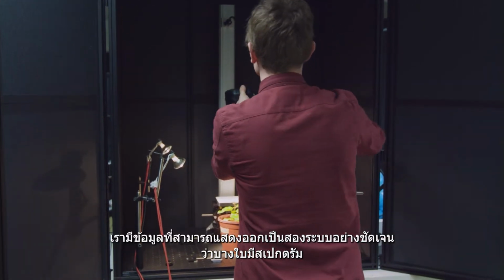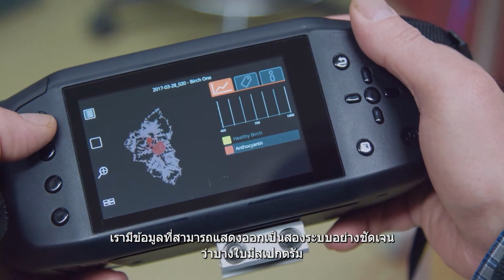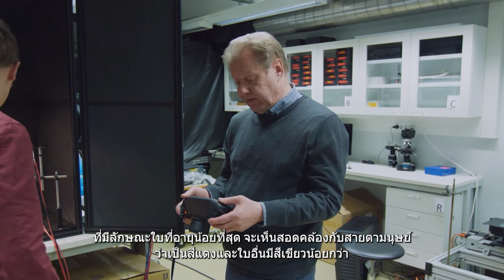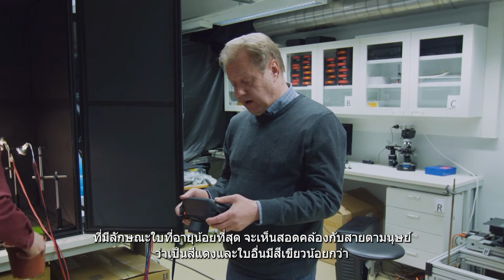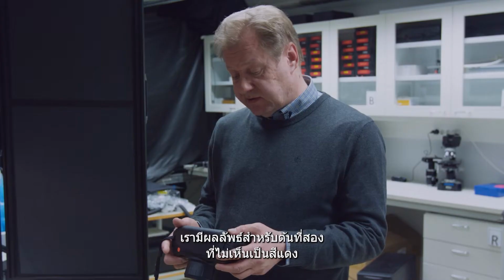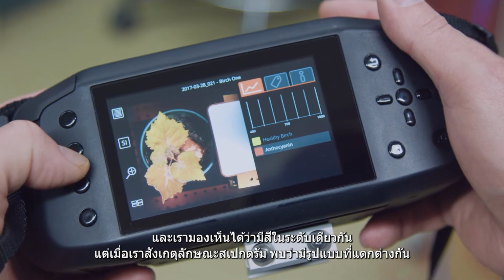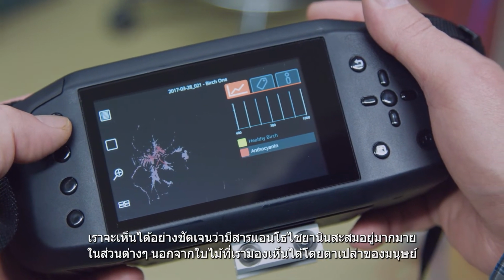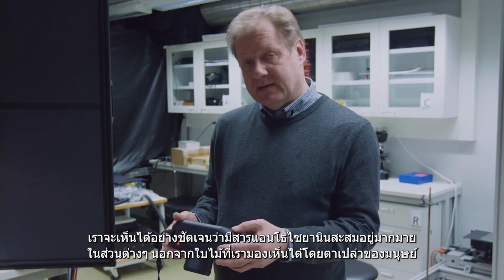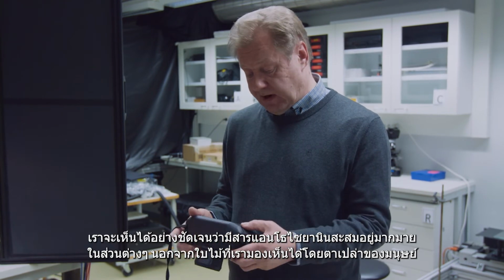So we clearly have two classes showing that some of the leaves have a spectrum that resembles the youngest leaves that appear to the human eye as red, and the other leaves are more or less green. Here we have the results for the second plant that was not so red, and we can see the same classes, but now we have a different pattern. We can clearly see that the anthocyanin is accumulating in many other places than on those leaves that we see with our human eyes.